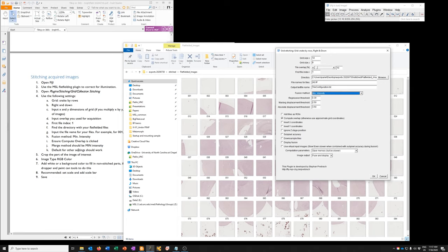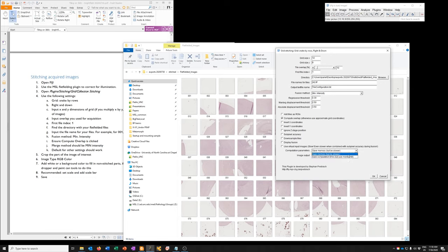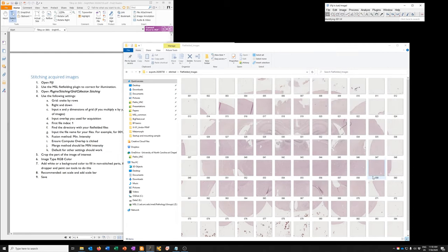The default for other imaging settings should work. I like to use computation parameters, save computation time, but use more RAM to speed things up if I'm on a computer that has a lot of RAM. If you're not, then just say save memory. I think the RAM on my computer should handle this just fine. So I'm just going to switch there so it goes a little bit faster. When you click OK.